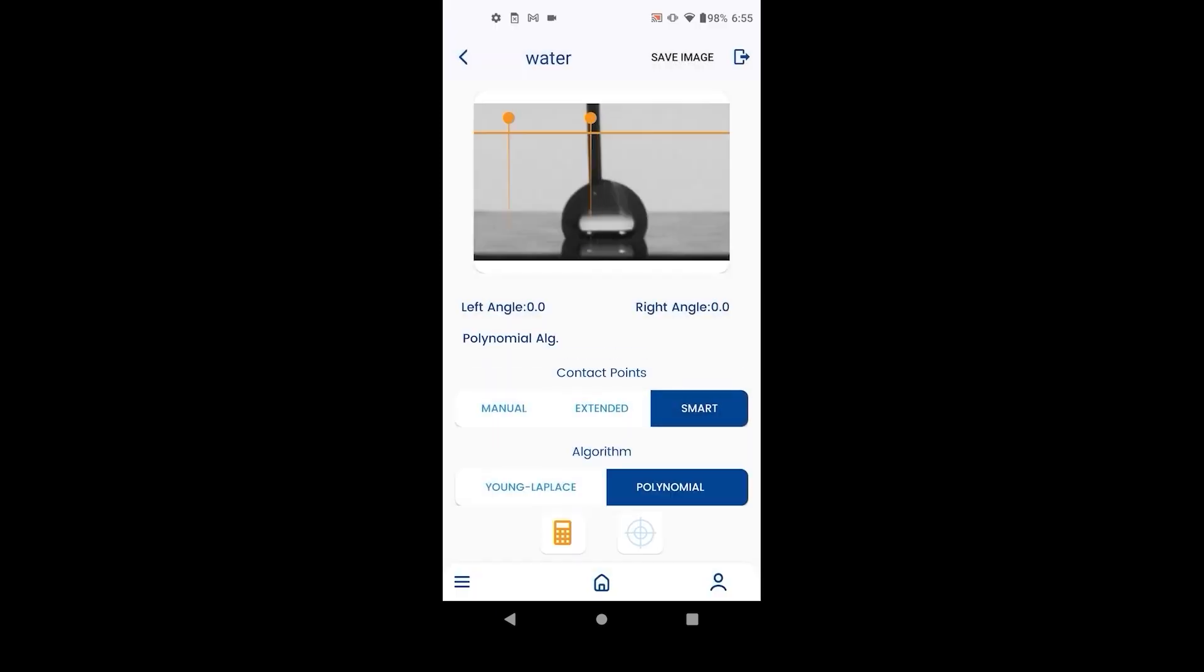The polynomial algorithm can measure left and right contact angles separately. Needle can be inside or outside the droplet. The default method is smart contact points.